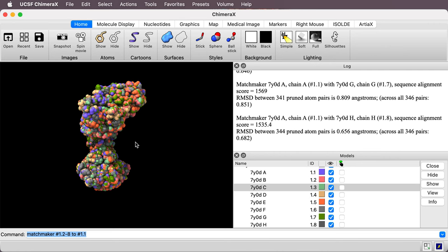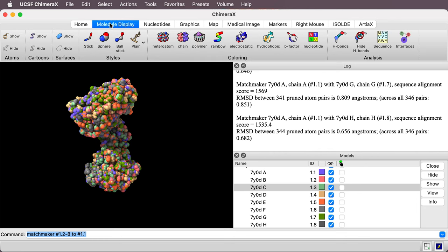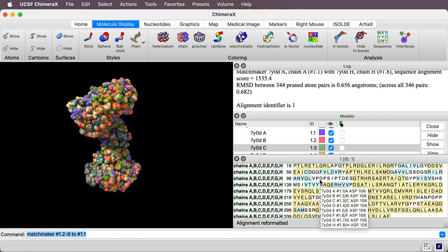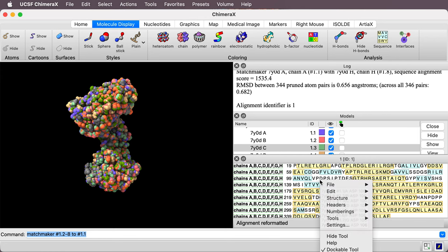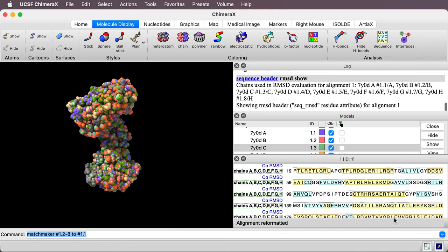So first I'll display the sequence of this protein. I'll go to the Molecule Display toolbar. I'll press the sequence icon here. That shows the sequence. And then if I right-click or control-click on this under headers it says C-alpha RMSD. So let me click that. That computes the C-alpha RMSD.